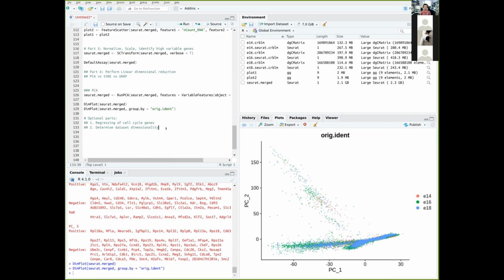I don't want to show it, I mean, it's fine. You can run this right now, just that because you have to recalibrate the matrix and renormalize, it will take a little bit of time. And I prefer to show you the downstream part, which is a little bit more important in this workflow. It's more like a tangent to the workflow, but it's actually very important, and I use that almost every time to remove the dependency on the cell cycle genes.